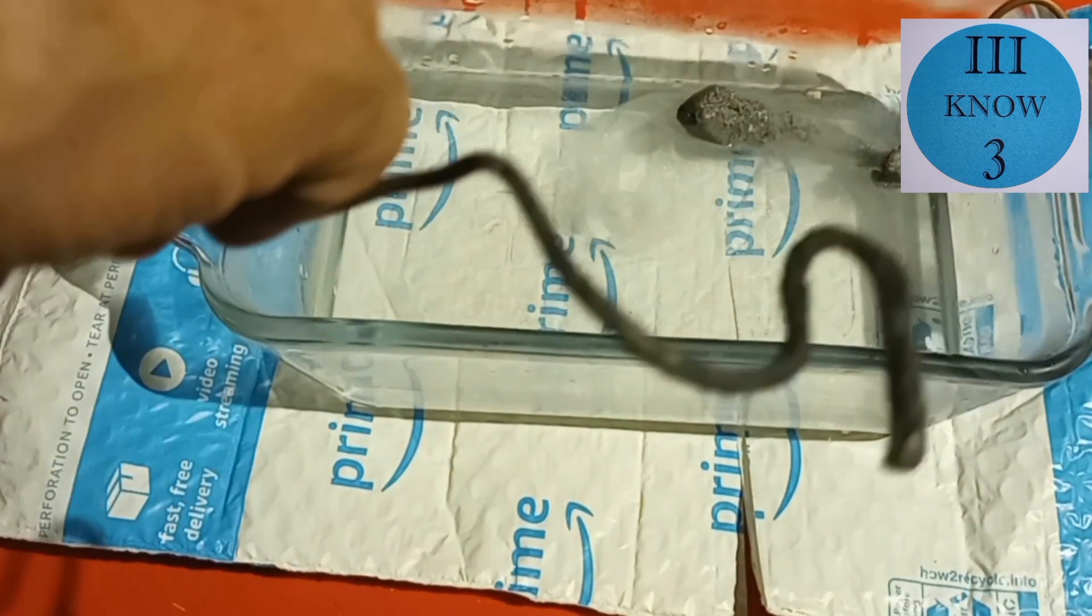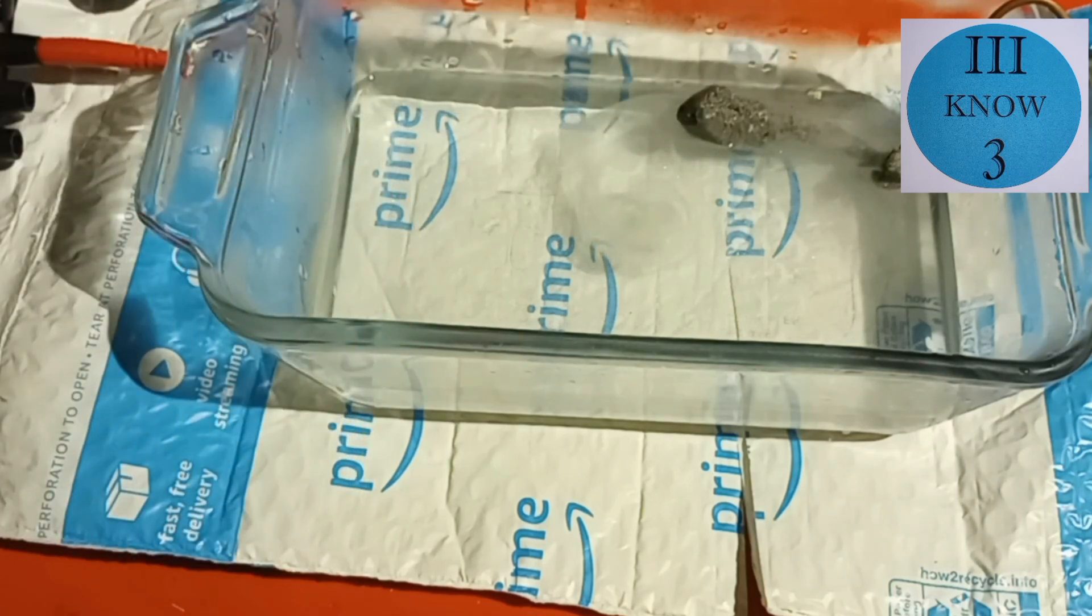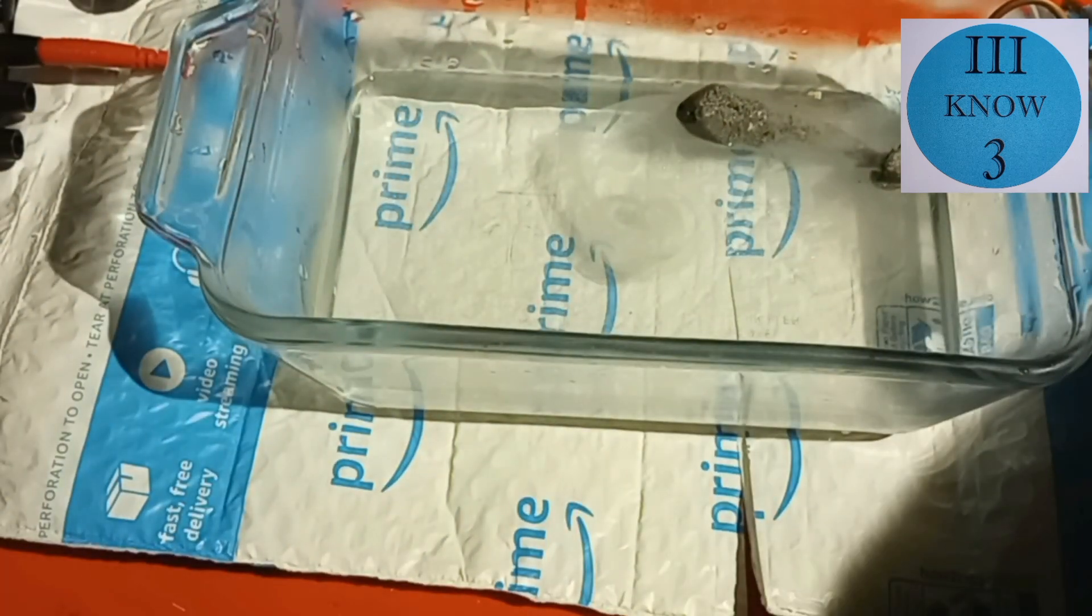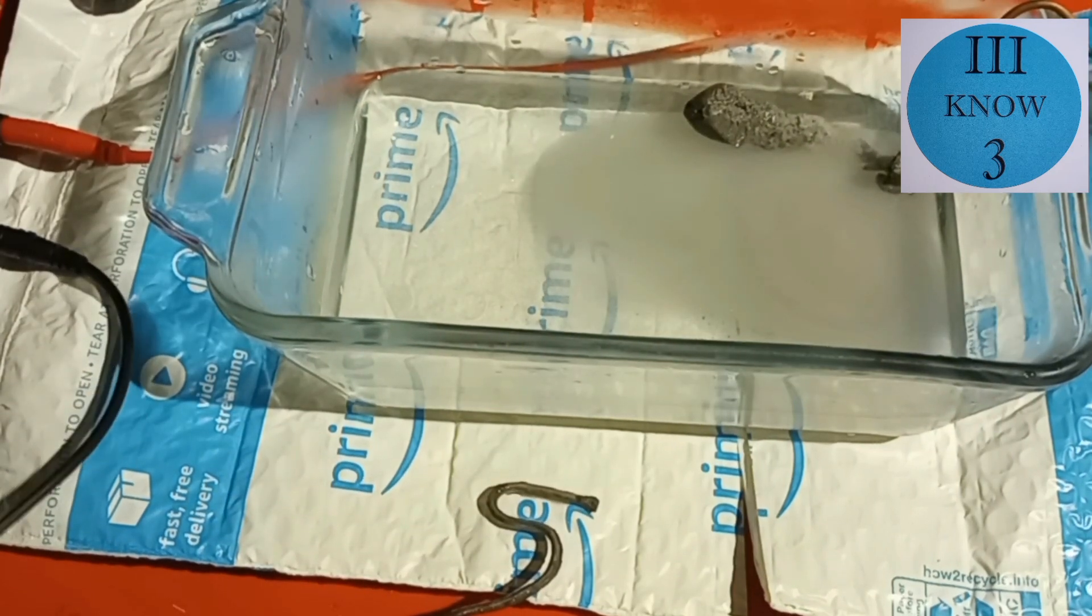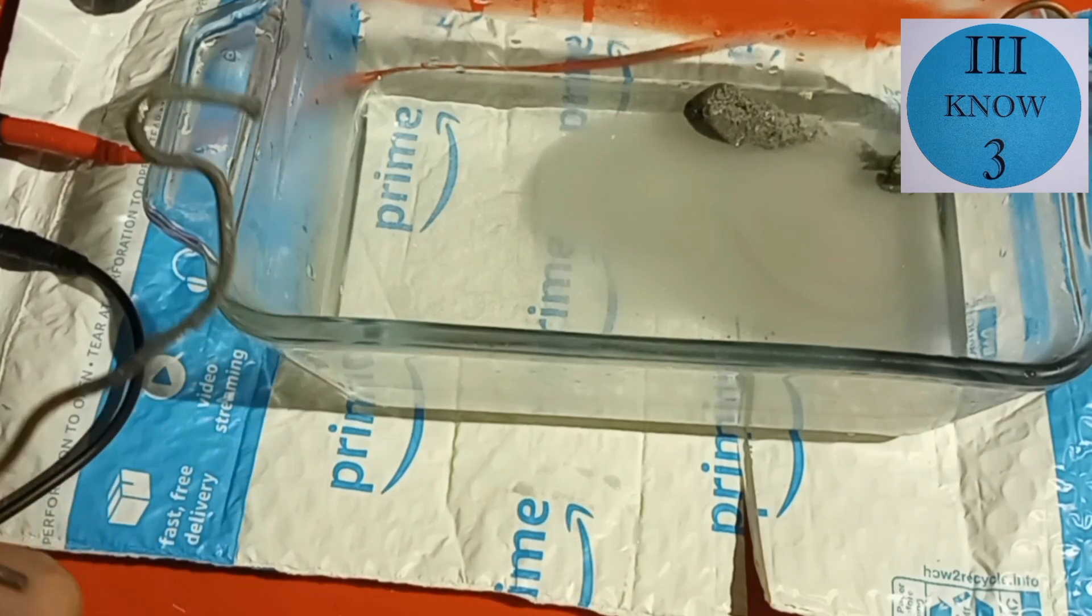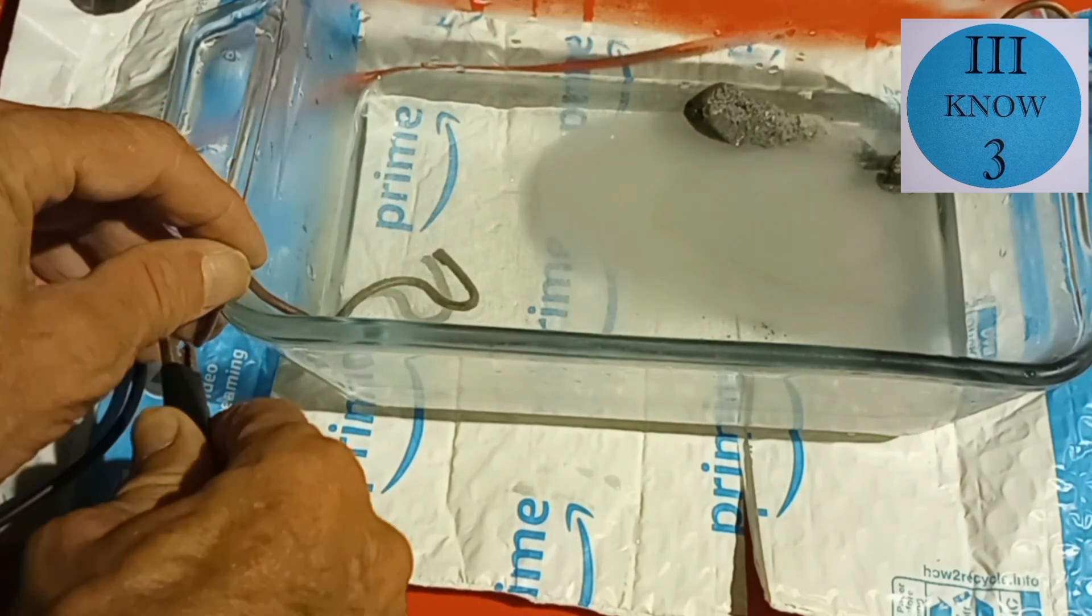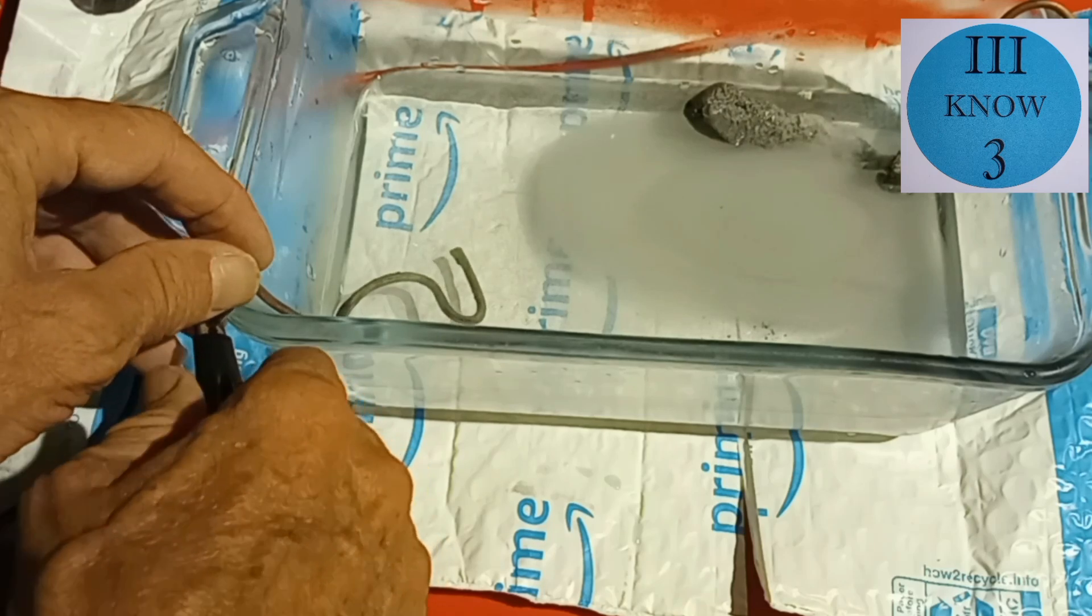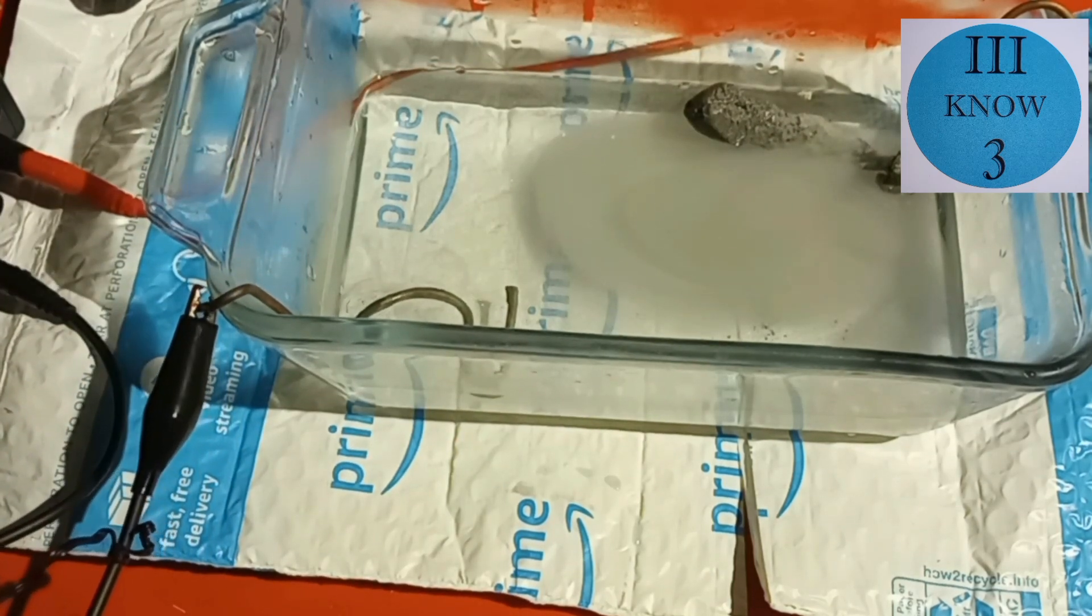For the cathode, we're going to use the other cathode from the last video, that is copper wire that has tin plating on it. And this is going to get hooked up to the black wire, the negative of the power supply. And then we'll turn on the power supply.